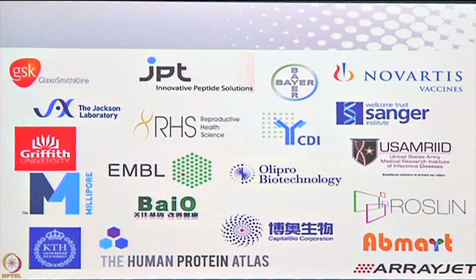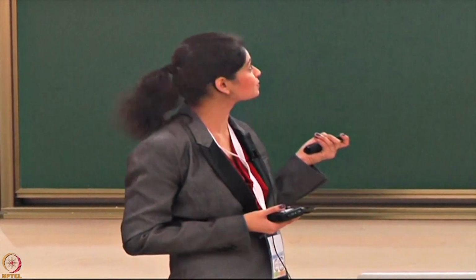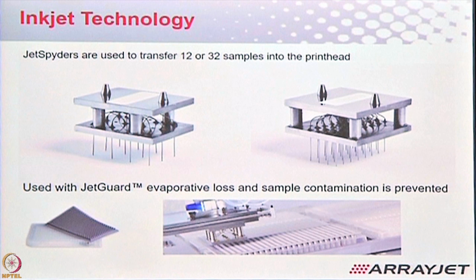And it is using a piezoelectric technology. So the printing is as quick as this, to be very honest with you. It's 0.2 meters per second. This is something that I'd like to circulate among you.